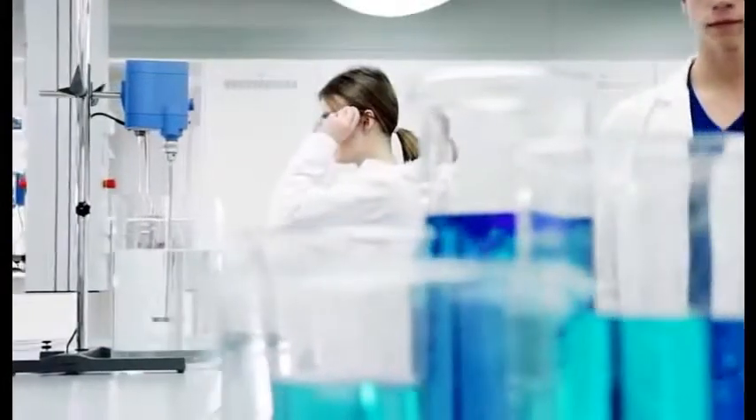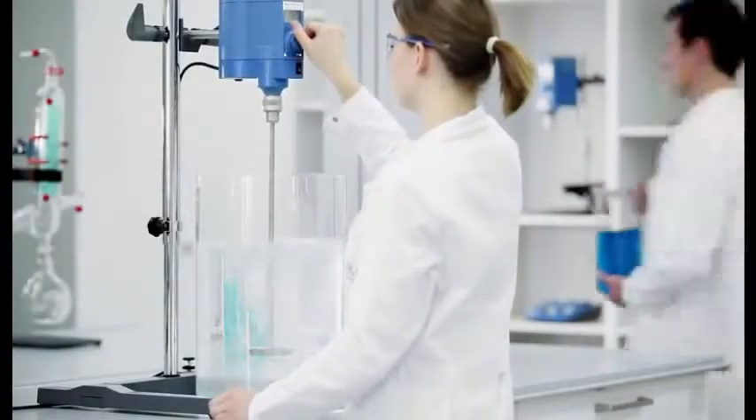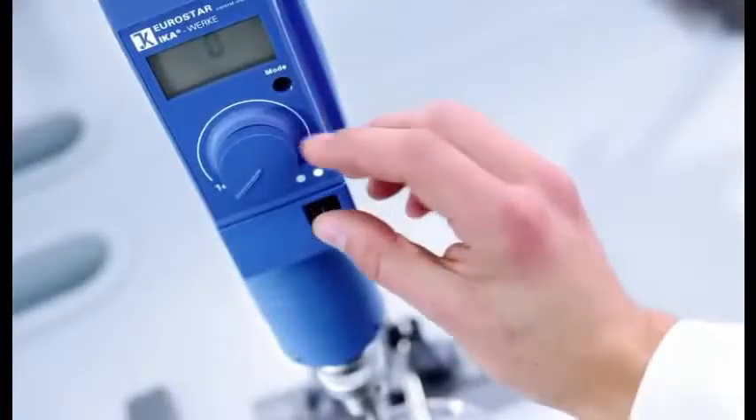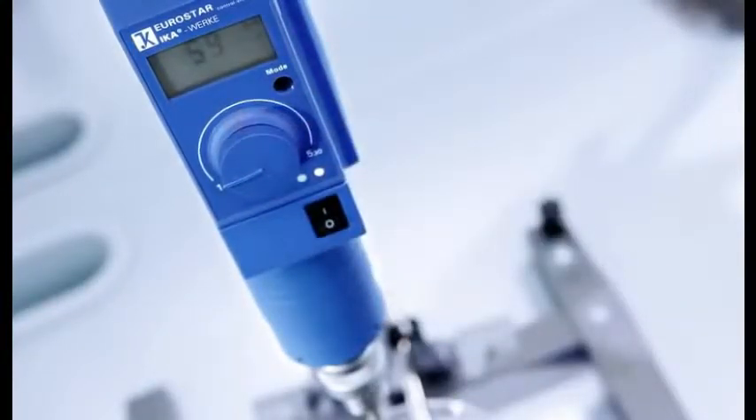Powerful technology ranging from 2 to 200 liters. Push-through agitator shaft allows for height adjustment. Microprocessor controlled electronics. Infinitely adjustable speed range. Digital display of set versus actual speeds. High-torque overhead stirrer, suitable for low to high viscosity tasks.